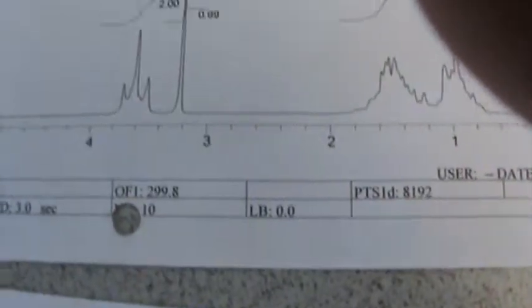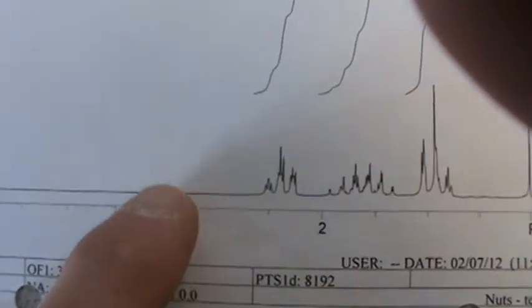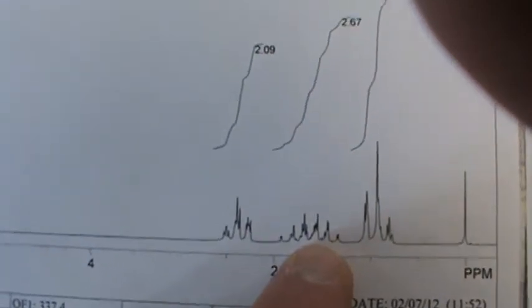Now remember, butanol, the starting material, was 3.6 or 7? So obviously, if you had any residual butanol, it's going to be sitting right over here in our product. This here, it's relatively symmetrical and nice. It comes out to an integration of 2.6.